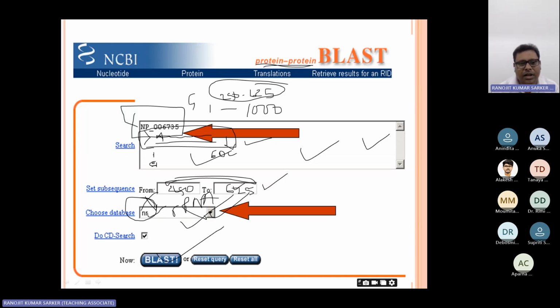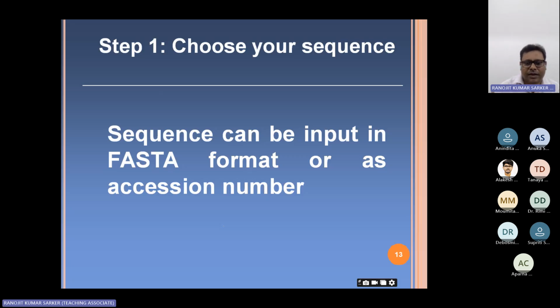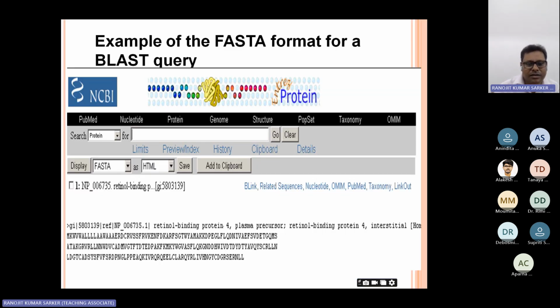So now you can go for the BLAST program. Now, if you know the algo, then you can get the parameters done. So we'll discuss this later on. So this is the FASTA format, accession number. As we discussed, this is the identification number, okay? And this is the description of the sequences. So this part will not be read by the software.